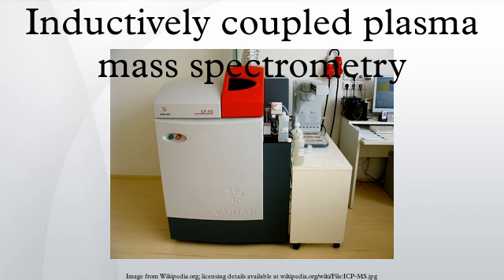Regardless of the sample type, blood, water, etc., it is important that it be free of clots or other particulate matter, as even the smallest clot can disrupt sample flow and block or clog the sample tips within the spray chamber. Very high concentrations of salts, for example sodium chloride in seawater, can eventually lead to blockages as some of the ions reunite after leaving the torch and build up around the orifice of the skimmer cone. This can be avoided by diluting samples whenever high salt concentrations are suspected, though at a cost to detection limits.